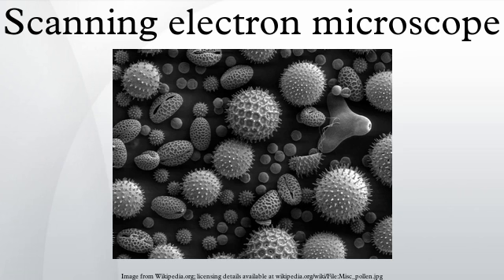The main preparation techniques are not required in the environmental SEM outlined below, but some biological specimens can benefit from fixation. Biological samples: for SEM, a specimen is normally required to be completely dry, since the specimen chamber is at high vacuum. Hard, dry materials such as wood, bone, feathers, dried insects, or shells can be examined with little further treatment, but living cells and tissues and whole, soft-bodied organisms usually require chemical fixation to preserve and stabilize their structure.